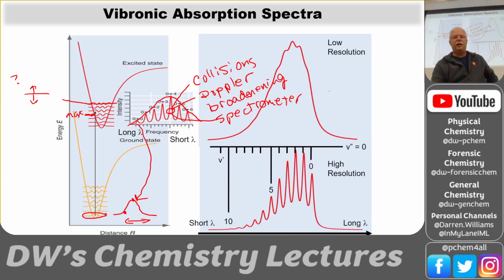And we can really see that spectrometer resolution here. At a really low resolution spectrometer, you don't resolve those peaks. And at a high resolution spectrometer, you can resolve those peaks. So in our particular spectrum, years ago, I wanted to give you guys more time to analyze the data, but the sacrifice of that is you don't get to sit up in the shared instrument space for 30 minutes while this collects the data.